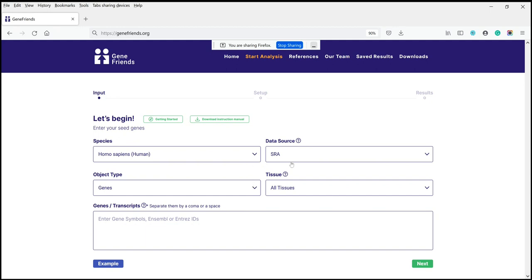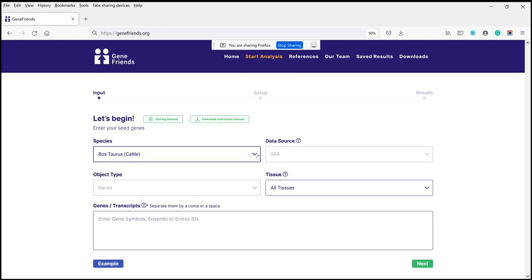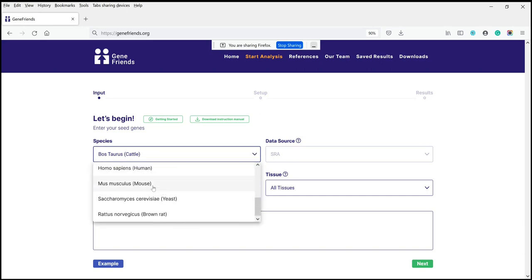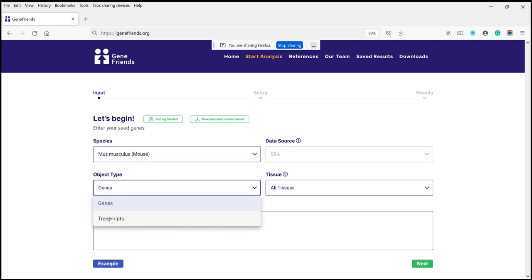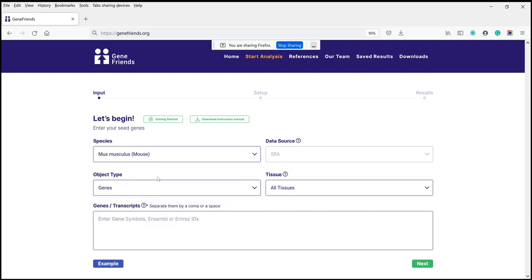For humans, you have different data sources, which I'll come back to in a second. If you use any of the other species, it doesn't give you any options in terms of data source. The only other species for which some further options are available is the mouse. There's no option in data source, but you can choose different types of objects, which are basically genes or transcripts. This is available for humans as well, as I'll show in a few minutes.